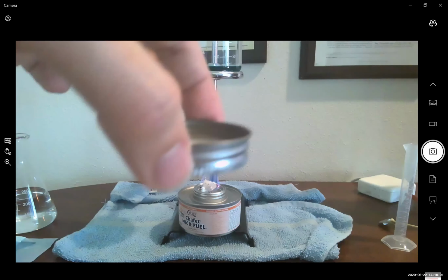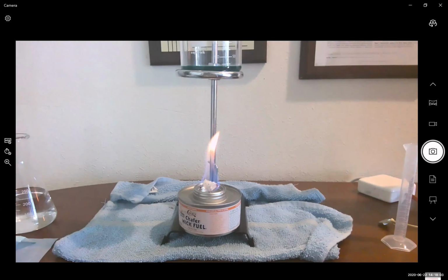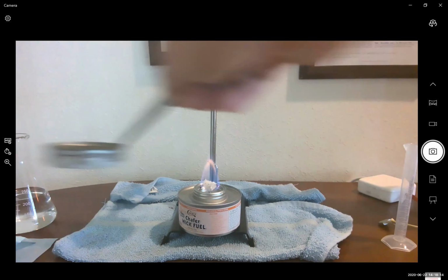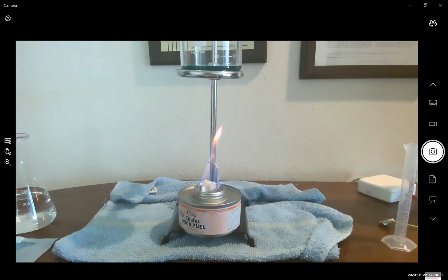Just to note, in terms of materials that I have handy, I have the cap always handy and ready to go. If the flame ever gets out of hand, you're going to use your forceps to put the cap back on, okay? Do not blow out this flame or you can spread a fire. Okay, so we're going to let this reaction go for a few minutes.